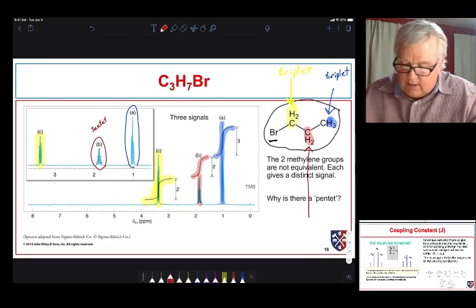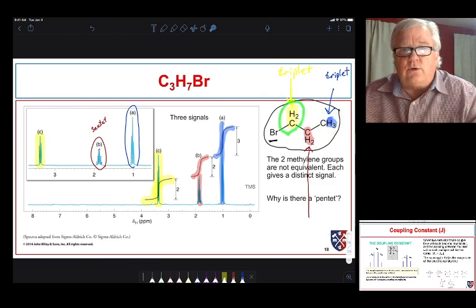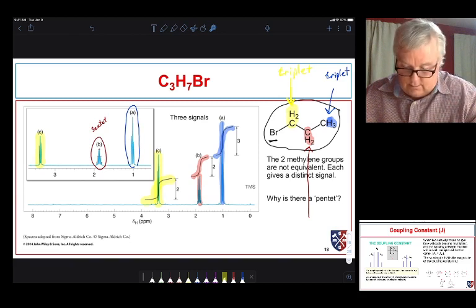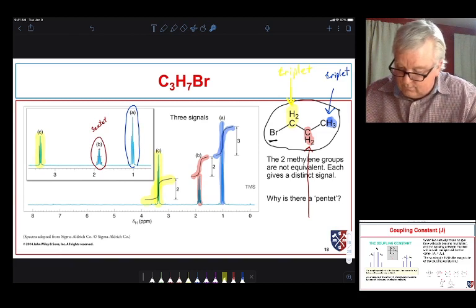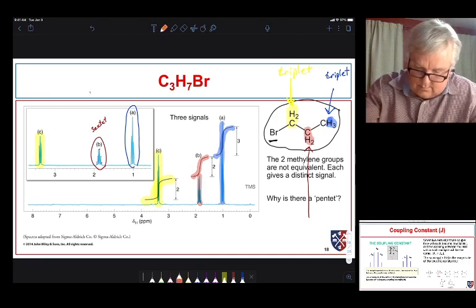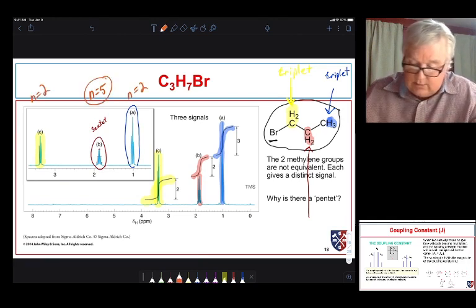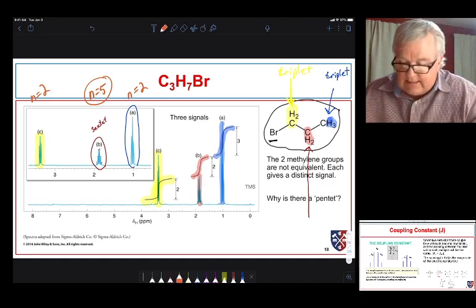Why is that a sextet? As it turns out, the coupling constant with the protons, let me get my laser, the coupling constant between those protons and this methyl group is pretty close to the coupling constant between those protons and this methylene group that I have circled there now. So, instead of we have 5. This should be sextet, by the way, right there. But we have n equals 5 in this case. It's easy to see why n equals 2 here and why n equals 2 here.